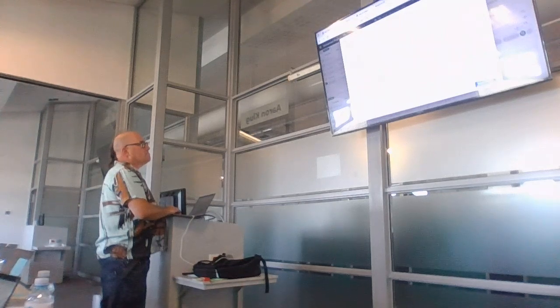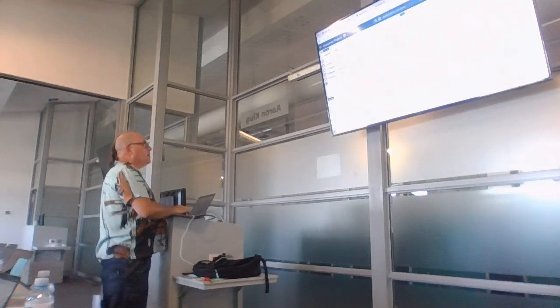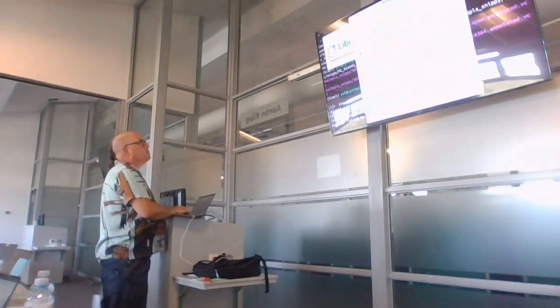See what happens. No, I have to restart the project. Okay. Department, this one. Department. Okay, I'm just going to load this file into LibreOffice just to make sure that I haven't totally messed it up. Which I probably have. While Peter's busy with that, you understand what's happening? Yes? No?